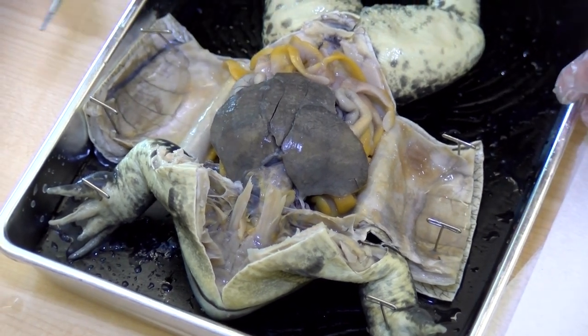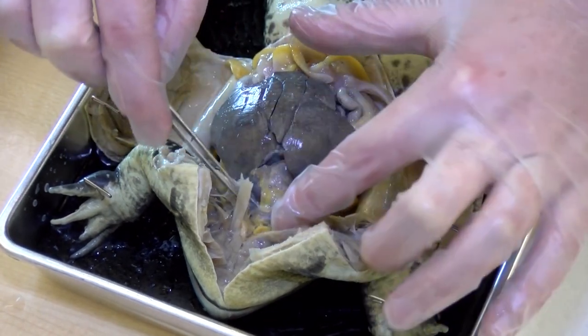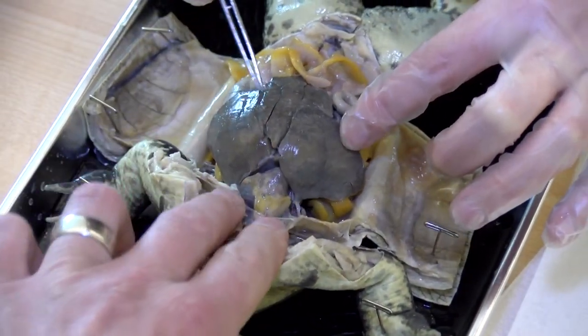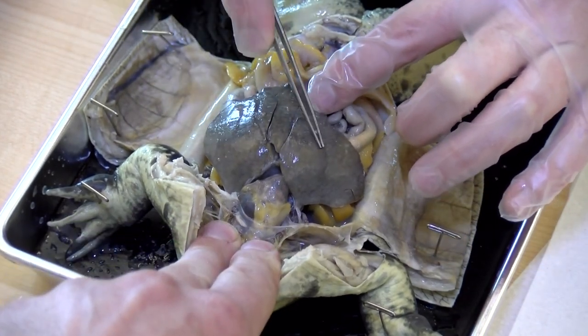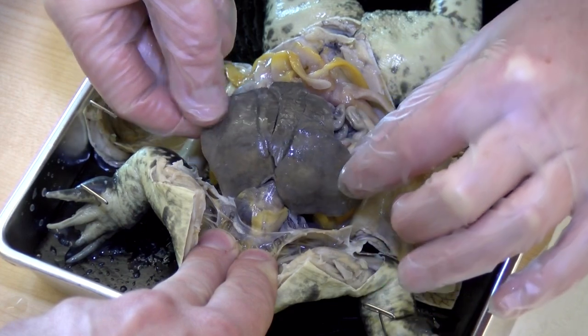Now that we've got this frog opened up, up here at the top is where we would find the heart. This large organ right here is the liver, and there are three different lobes to it.